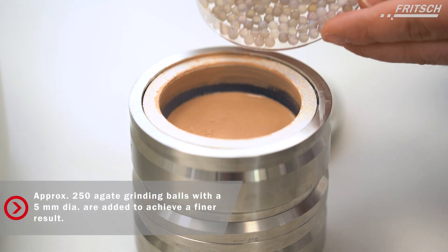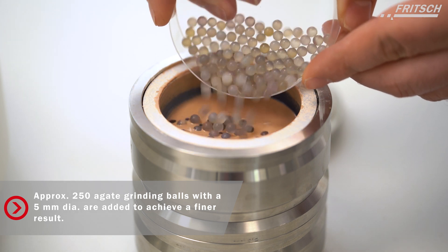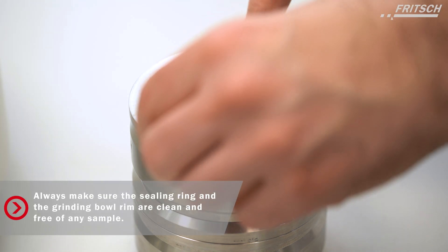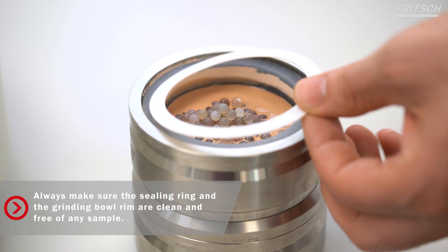Smaller grinding balls are now added to the sample to get an even finer result. Again, make sure the sealing ring and the grinding bowl rim are clean and free of any sample.